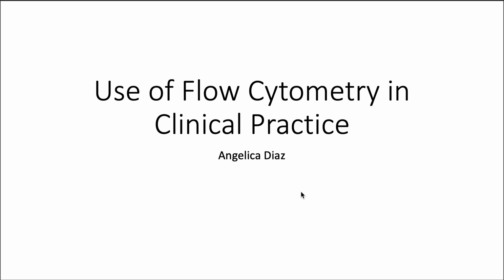My name is Angelica, and the topic for today is the use of flow cytometry in clinical practice.